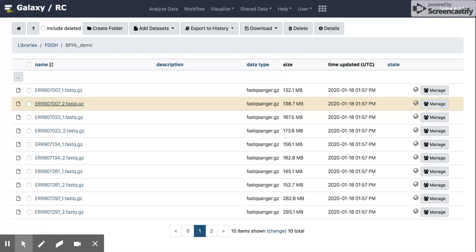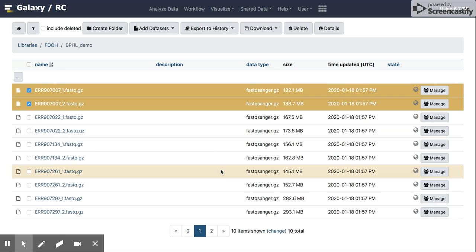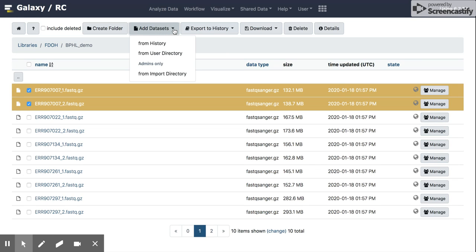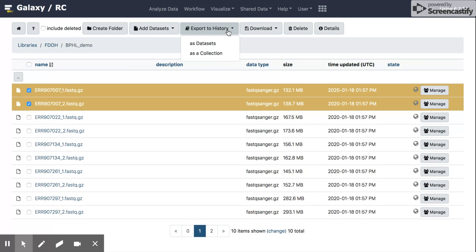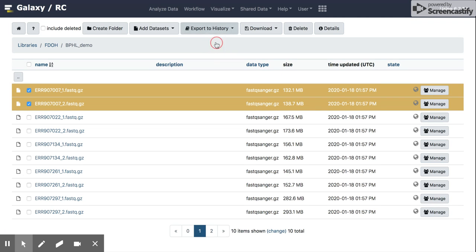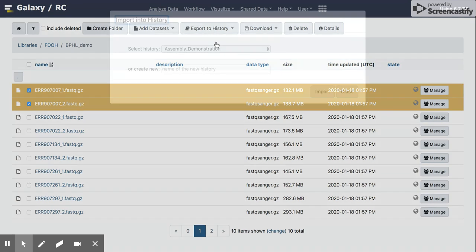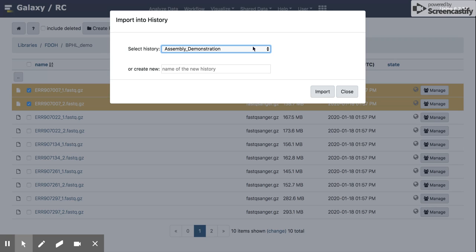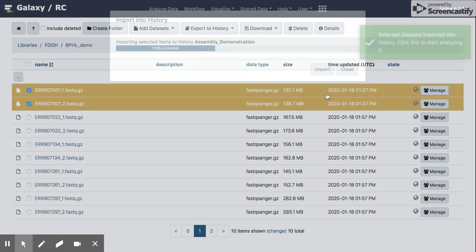So the first thing I'm going to do is I'm going to click here to select a pair of these isolates. And I'm going to import this into a history. So I can click on this button here. Oh, wait. Let's see. So export to history. And I'm going to select as data sets. And it should give me options for which history I want to export it to. You can see I have a number of histories in my history. And I'm going to select the first one, which is the one we just created, assembly demonstration, and click the import button.